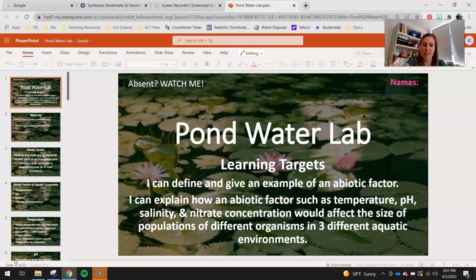Hey, 7th graders, this is the pond water lab, and this is going to be a 2-day lab. So if you guys are gone both days, obviously you guys are going to watch this video. You're going to do this whole assignment. You guys will be able to collect data from home using the other videos that I've linked throughout.